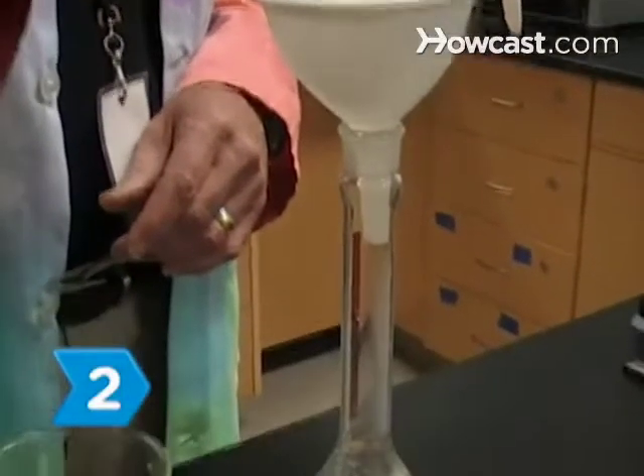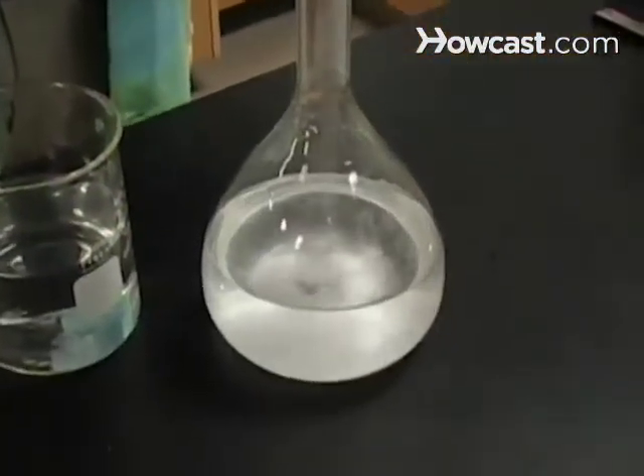Step 2. Weigh 3.8 grams and transfer it into a volumetric flask using a powder funnel.